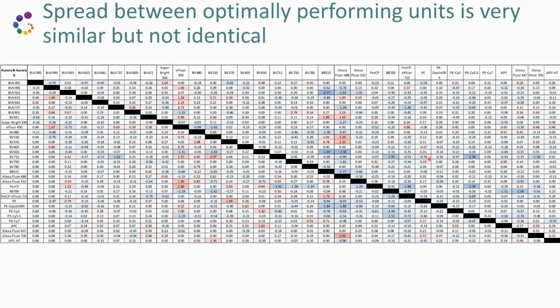And for a flow cytometer, if you look at SSM, that is amazing. It means that the spread between the two instruments is very, very, very comparable. You can do the exercise with other instruments. I bet you are not going to get this level of agreement. If you see differences starting to be higher than 5, start taking a close look. Higher than 10, we need to investigate what's going on. So this is amazing. If you are familiar with SSM, you know that values higher than 10 are problematic. And here we're showing a high level of agreement in the spread between the two systems.